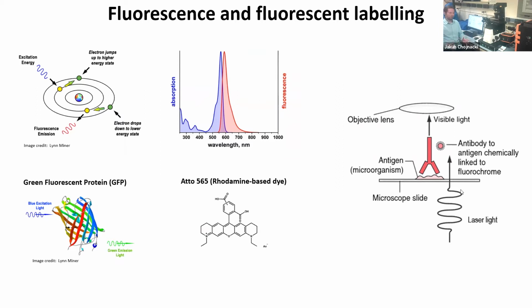They recognize very specific molecules, and when those molecules are touched by antibodies, our immune system can recognize them. We scientists have taken advantage of this and started utilizing antibodies to be specific to structures of interest in fluorescence microscopy.